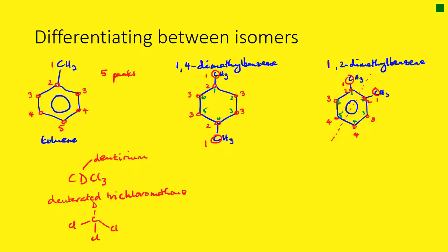So that would be a solvent, and that's a particularly good solvent for proton NMR, because deuterium has an even mass number, which is 2, of course, in deuterium's case, 1 proton, 1 neutron. That doesn't make a peak in a proton spectrum.